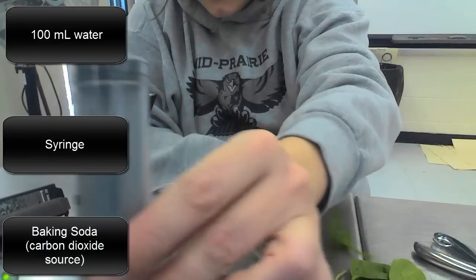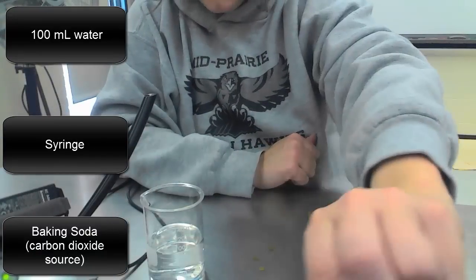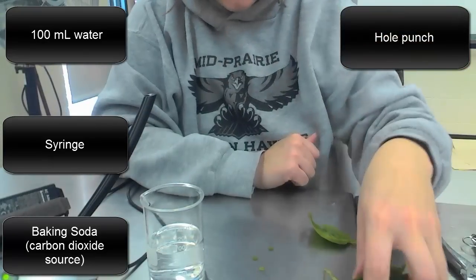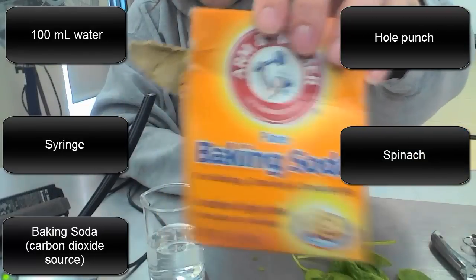So you can see the syringe there. No needle in the syringe. You'll need to have a hole punch. Let's see if I can grab that. So a hole punch. You'll need some spinach leaves, and then you'll need some baking soda.